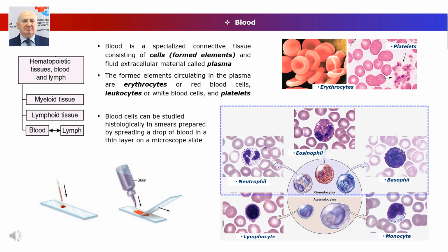Granulocytes possess two major types of abundant cytoplasmic granules, lysosomes, often called azurophilic granules, and specific granules that bind neutral, basic, or acidic stains and have specific functions. According to the coloring of the granules, all granulocytes divide into neutrophils, eosinophils, and basophils. Mature granulocytes have segmented nuclei.